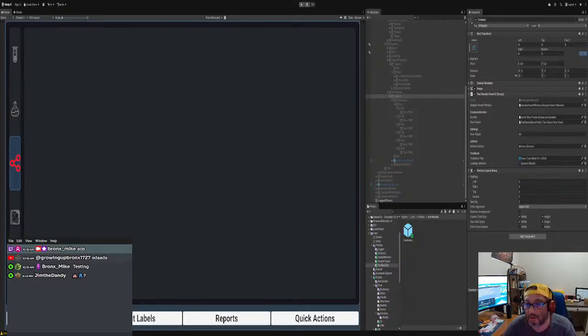And then we got our, okay, so this is what we get. We get our test results, boom, boom, right? And then we add it to the list, correct? Complete. Wait a minute, what's this? Is load data, yeah. Complete hemoglobin, complete load data. Oh, wait. Set data. Try to do get. So it's placeholder. Oh yeah, I did it for just a demo.